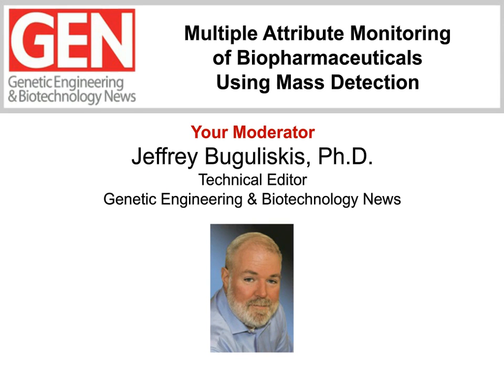The development of biopharmaceutical compounds requires vigilant monitoring of formulation and production reagents for both safety and accuracy. While most current production procedures involve the detection of analytes through the use of optical detection methods, industry trends and increased regulatory stringency have manufacturers incorporating mass spectrometry analysis more frequently, due in large part to its ability to analyze more complex molecules within a shorter time frame.